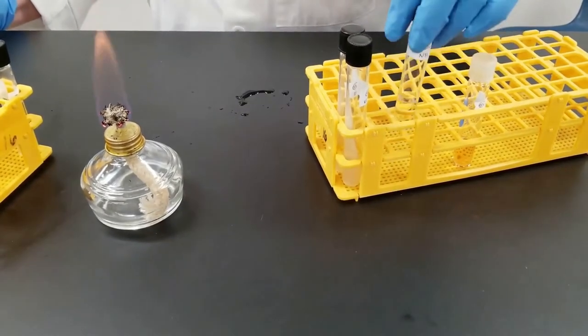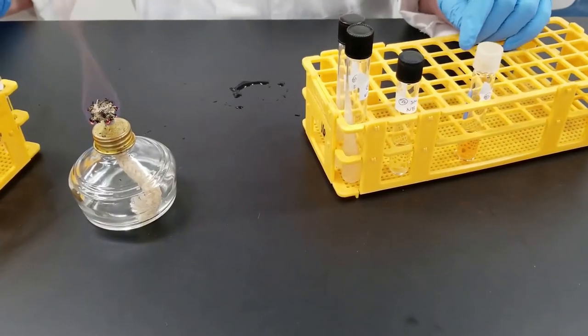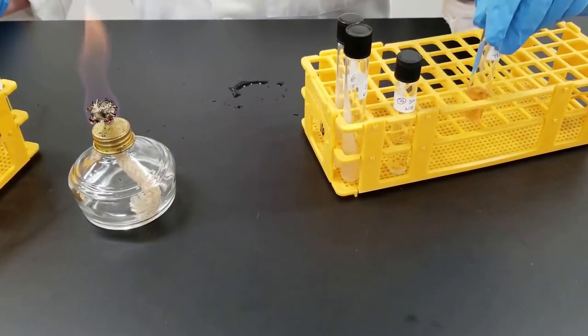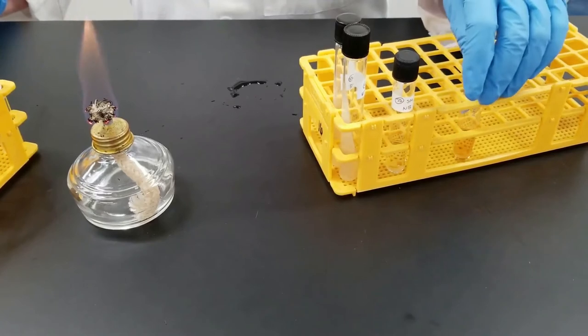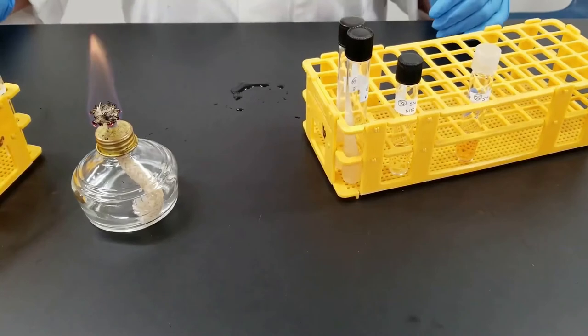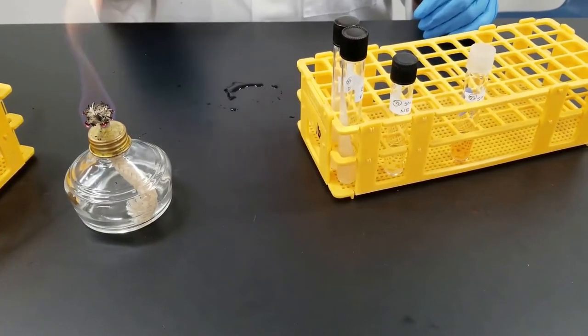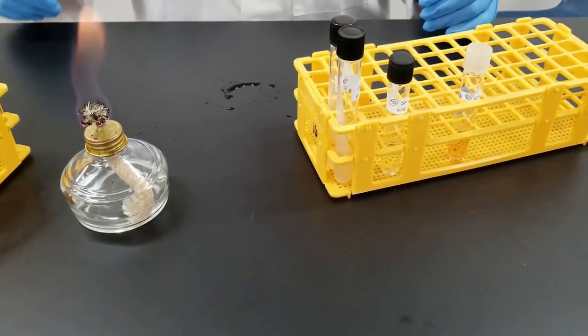We have the nutrient broth that we will grow it in. So we're going to go from a broth to a broth. We haven't done that very often. We're also going to use thioglycollate, which will give some indication for the oxygen requirements, depending on where it will grow. Will it grow at the top versus throughout the entire medium or only at the bottom?